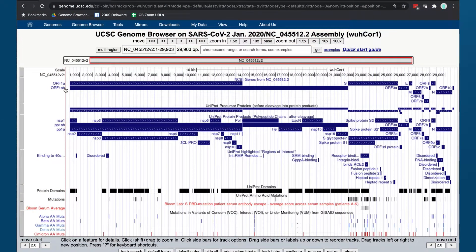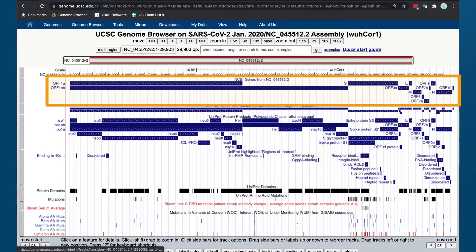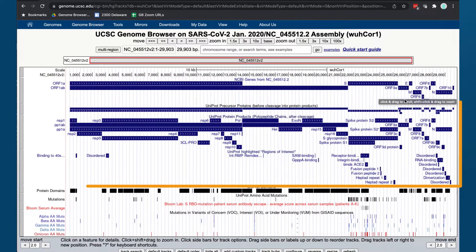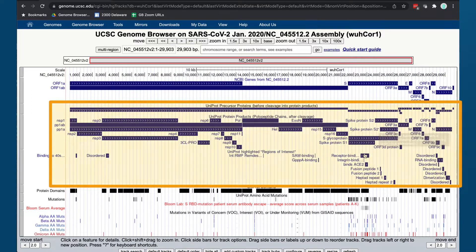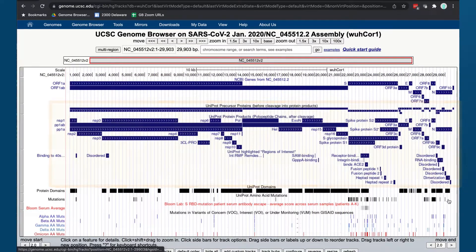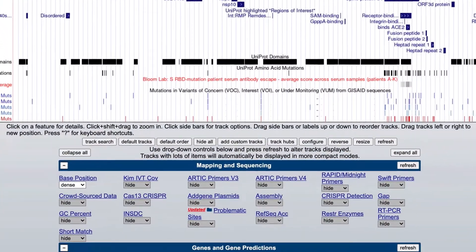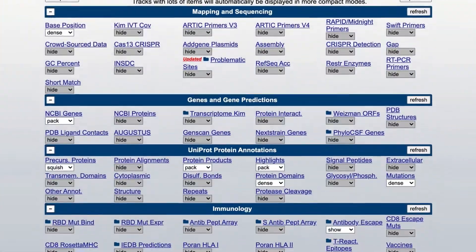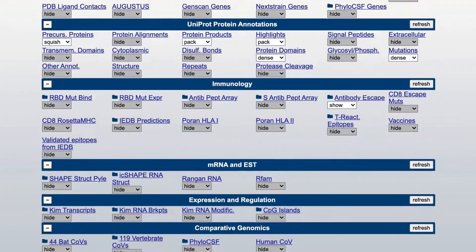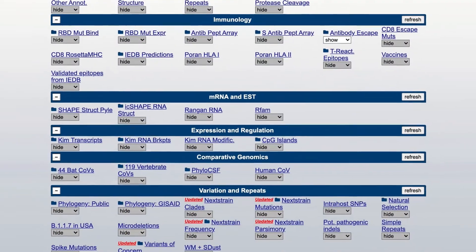When it opens, you will see the entire 29.9 kilobases of RNA in the reference genome and all of the protein products. You can use the Genome Browser to discover the genomic structure of the virus, where the proteins are and their features, how variants of concern differ from the reference and from each other, conserved domains, antibody-binding experiments, and much more.